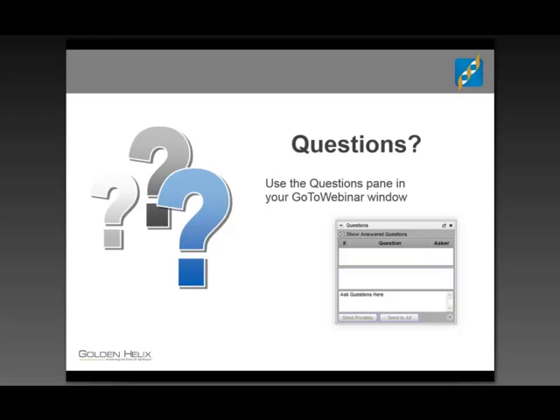And we also have ways of, even if it's not traditional DNA sequencing variants coming in from a VCF file, we can still aggregate information over genes. If it's coming from a microarray, your probes are not necessarily in a gene, and so you might need to expand your definition of a gene region by a little bit, but we do have that capability.